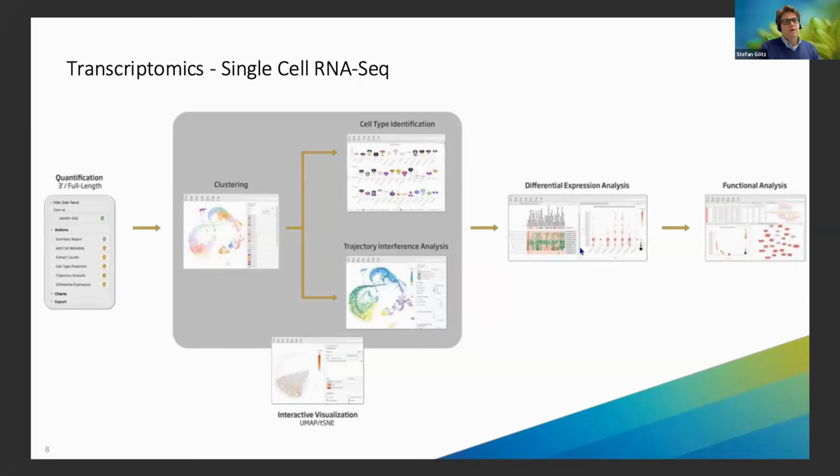And then we have our differential expression analysis, identifying which genes are up and down regulated among certain cell types. And then you can go again into the functional analysis, which we are looking through today as well, which can also be useful for those kinds of pipelines.